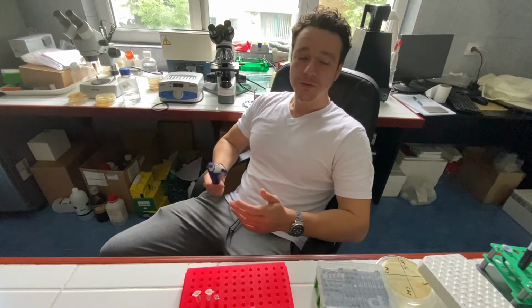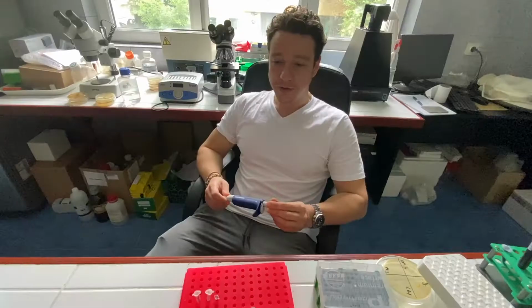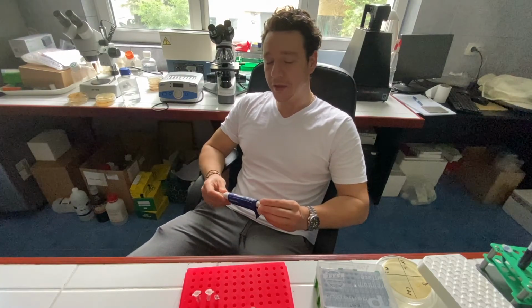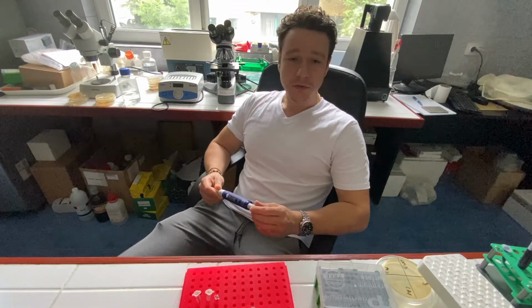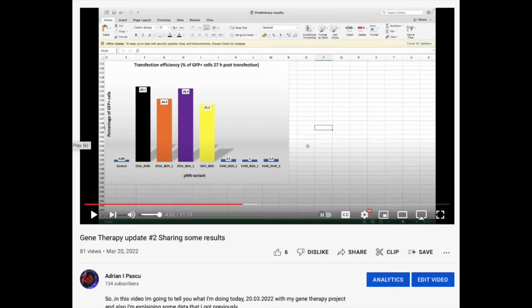Right now I'm doing a PCR for my gene therapy project, and I figured what a better time to post an update on what I've been doing in the last couple of weeks or months than right now. If you don't know what I am talking about, you can definitely check out my other videos. I am trying to post regular updates on what I've been doing and on my progress.